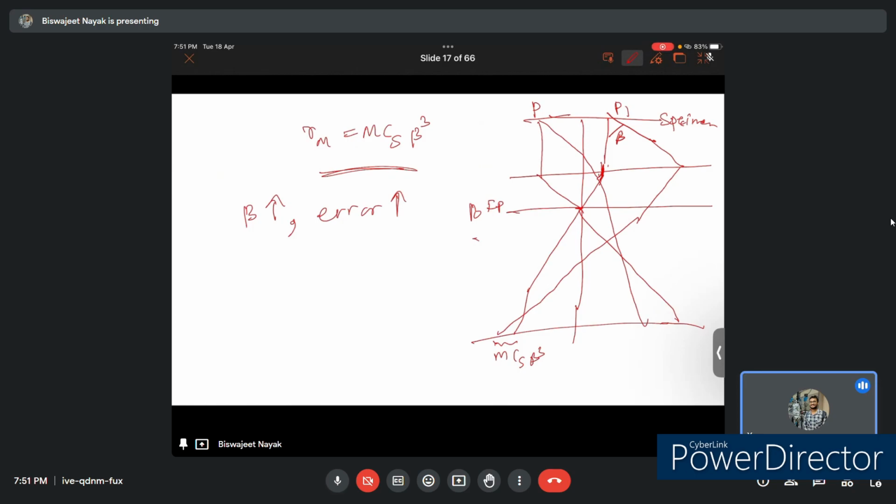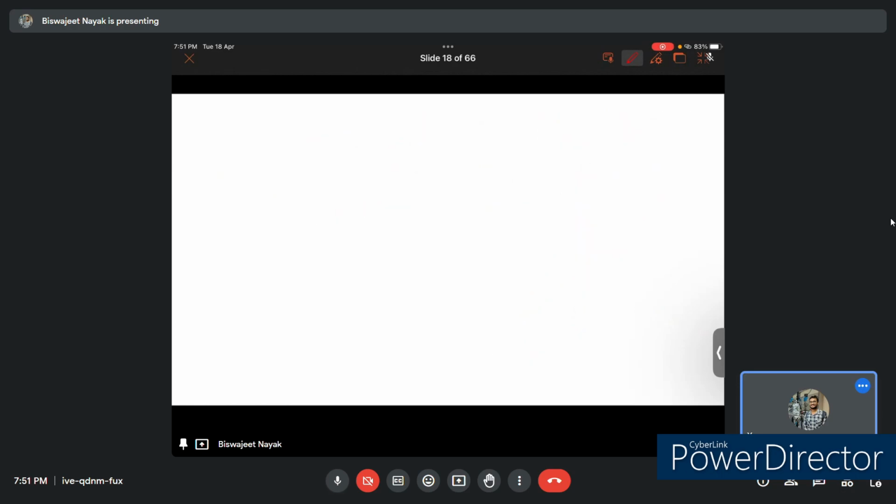And again, if the lens is not focused on the SAD plane, consider the specimen plane, the incident beam, shifting the selected area y.